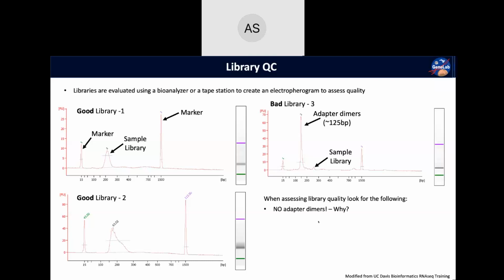So much so that the majority of the sequence you're going to get back, even with a little bit of adapter dimer contamination, will be adapter sequence. And so you're basically throwing away money because all you're doing is sequencing adapters and not your region of interest. But you're absolutely right that you can indeed remove that in silico, for sure. And I'm going to show you how just a little bit of contamination can lead to a whole lot of problems in terms of what's sequenced.